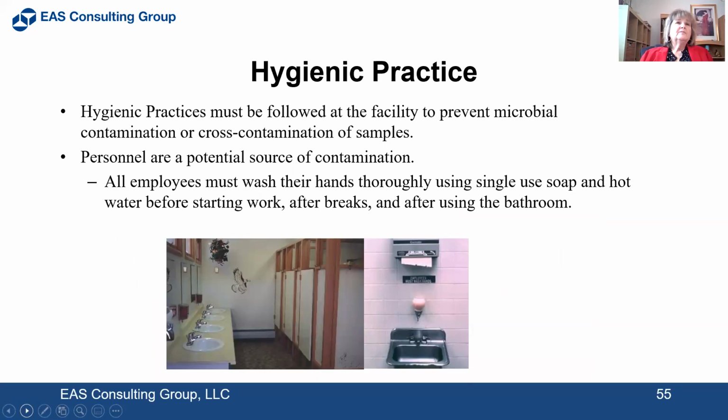Want to make sure that your employees follow hygienic practice to prevent microbial contamination or cross-contamination of samples, and realize that personnel are always a potential source of contamination. It must be required that all employees wash their hands thoroughly with soap and hot water before starting work, after breaks, and after using the restroom.